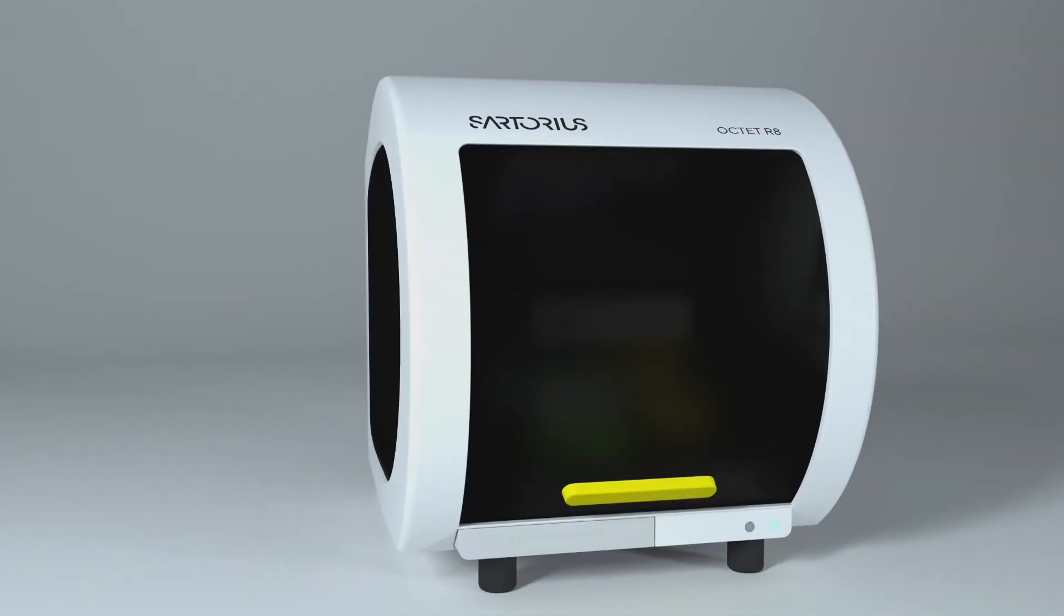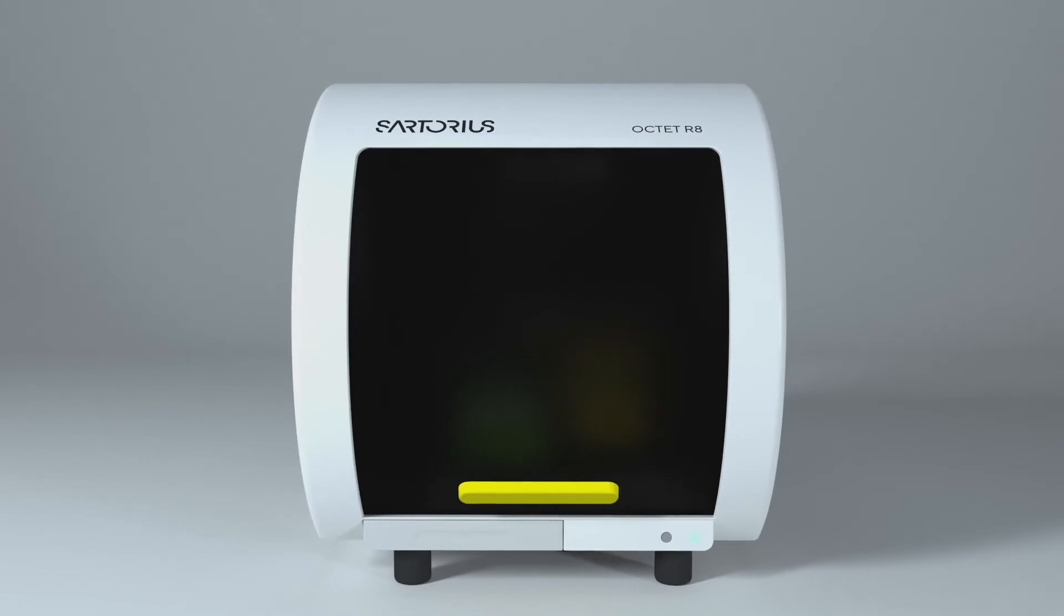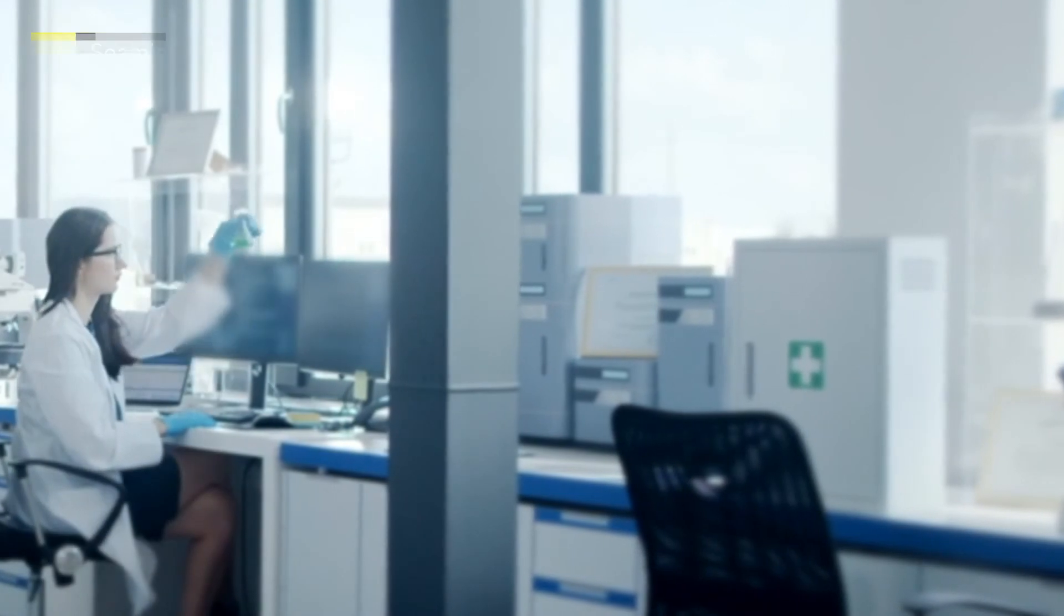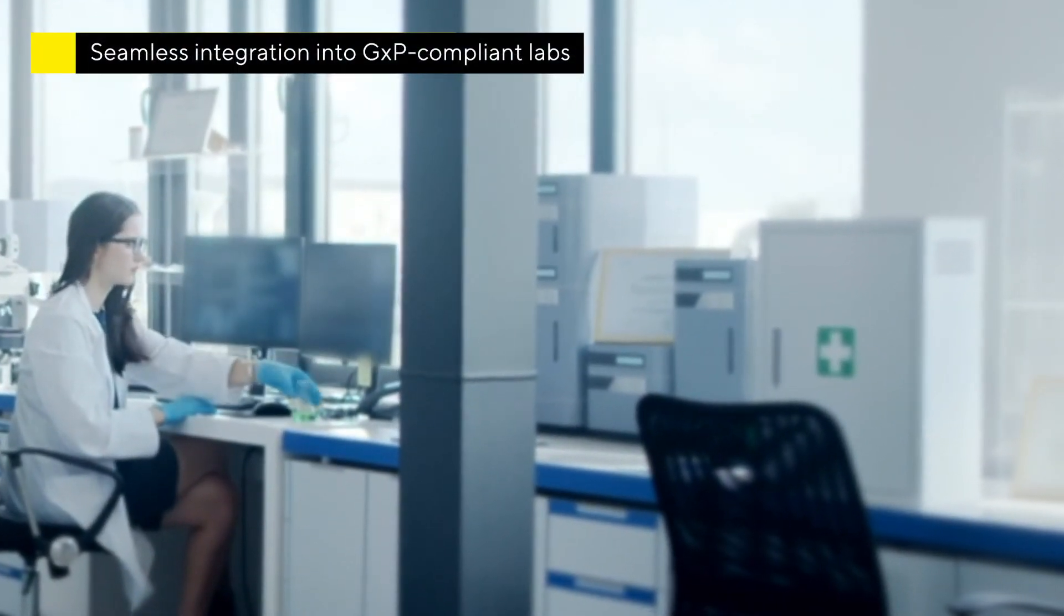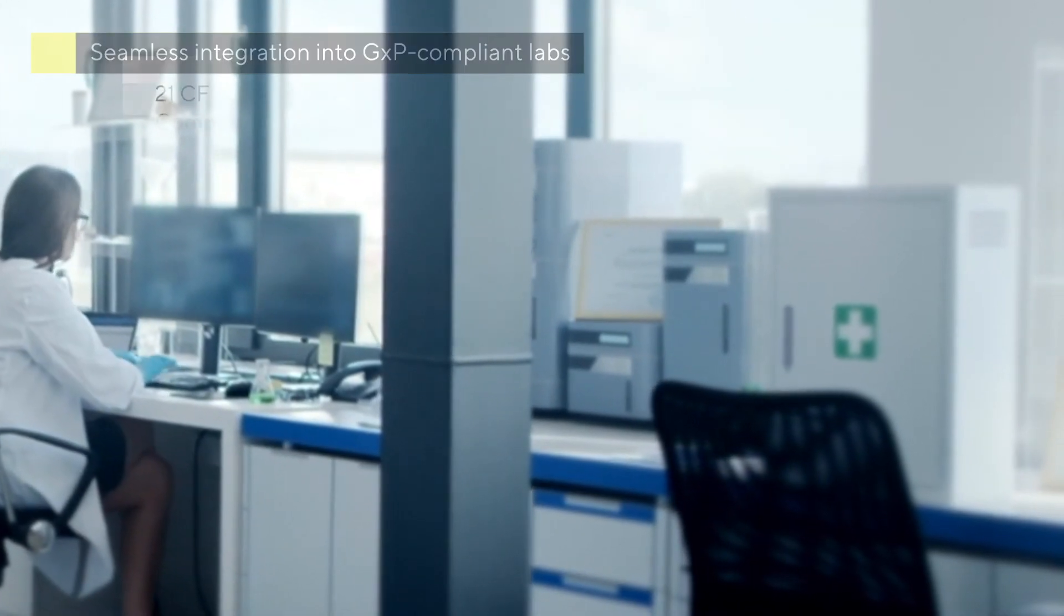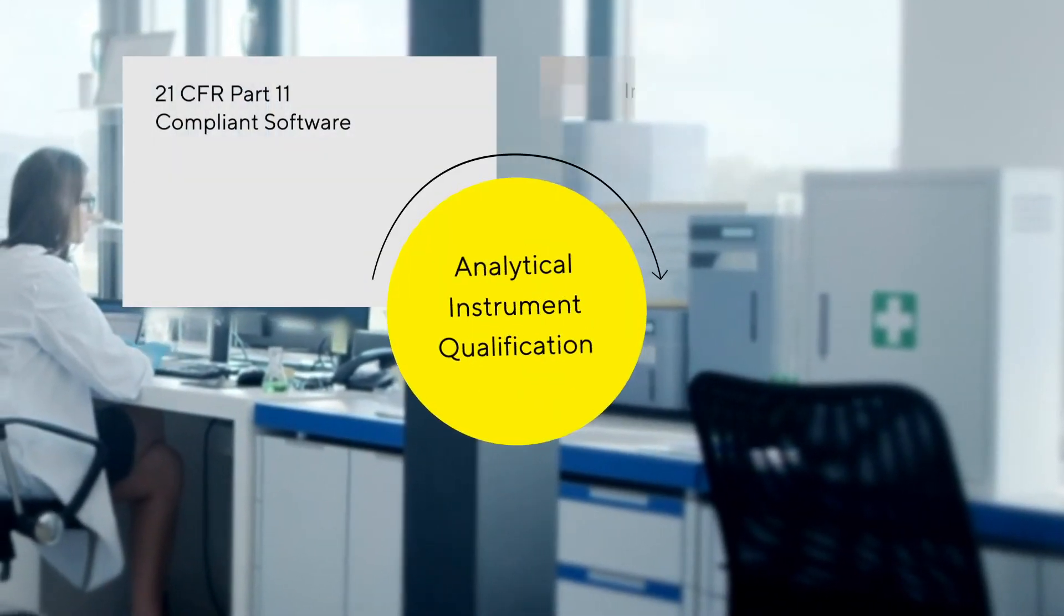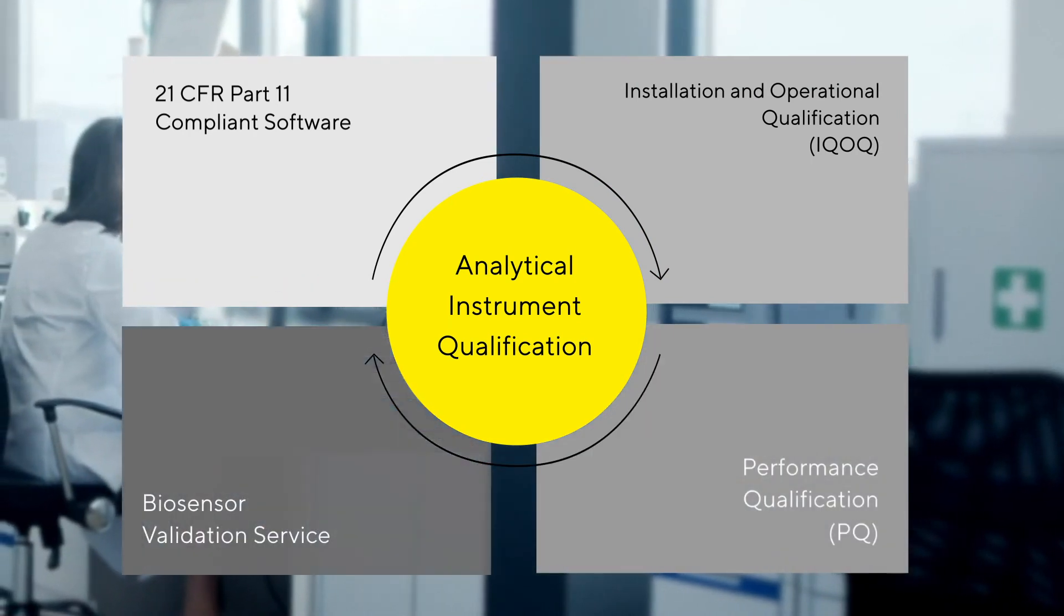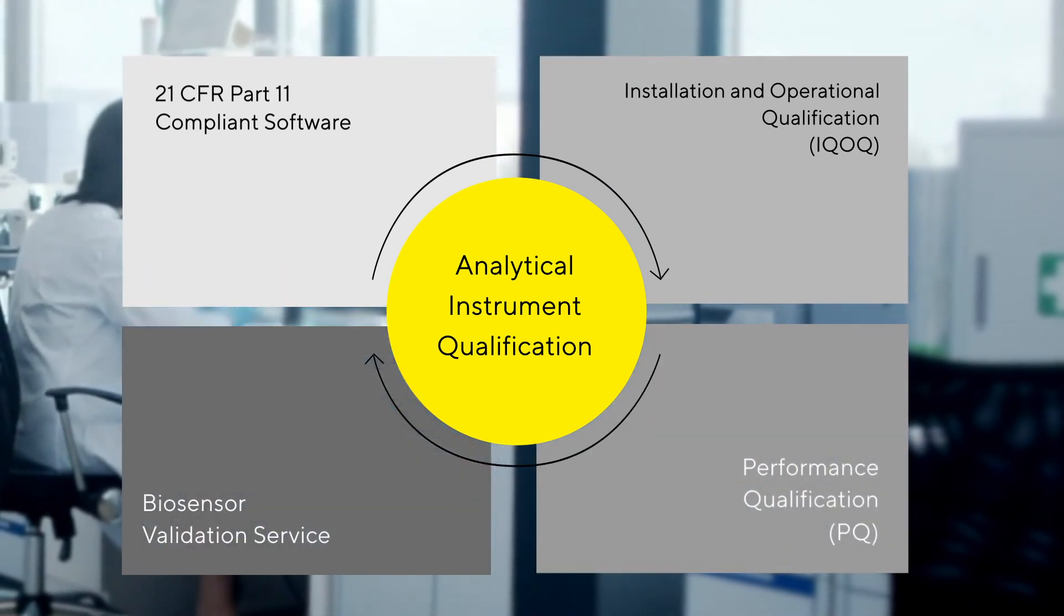The top-of-the-range Octet-R8 offers high-throughput analysis while still being within budget of most labs. Intended for use in both peer research and GMP environments, the Octet-R8 is designed to work seamlessly with 21 CFR Part 11-compliant software, simplifying and streamlining the compilation of documentation for regulatory filings.